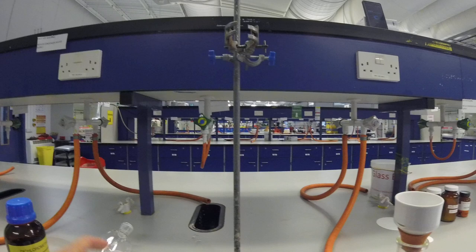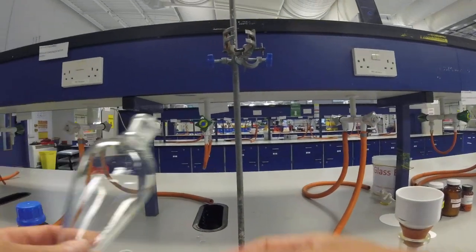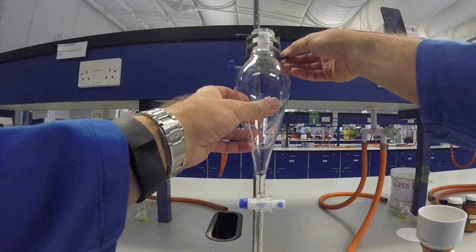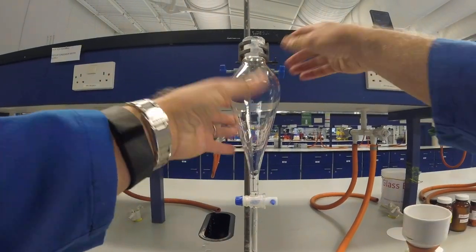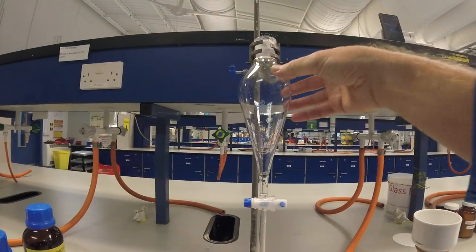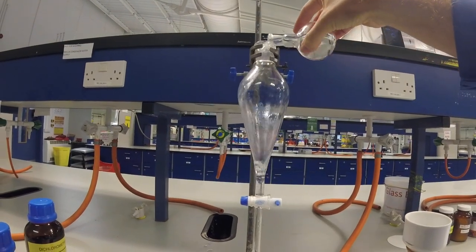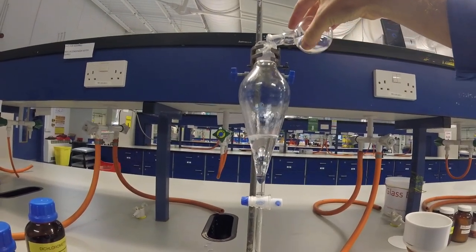The first thing we do as part of the workup procedure is a liquid-liquid separation using a separating funnel. So you're going to get yourself a clamp and stand separating funnel and then you pour your reaction mixture into the separating funnel.